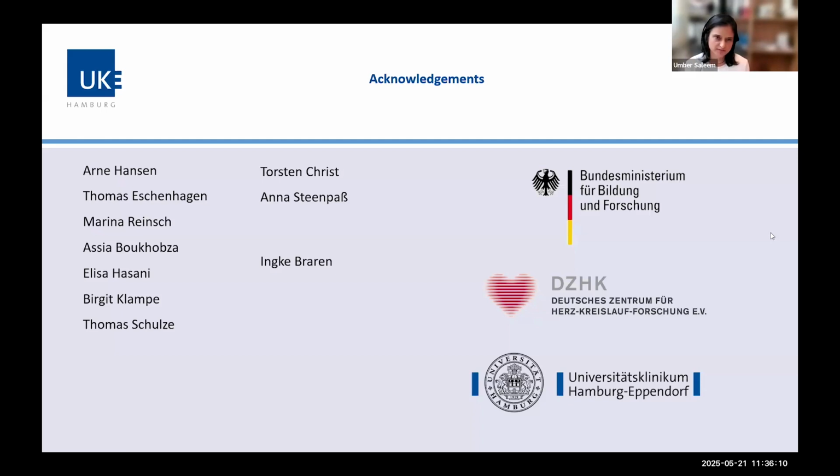Okay. So at the end, in your opinion, it's important to have all the three functional readouts. Yeah, so actually now we cannot use the calcium and voltage together, but for the moment we can only use force either with calcium or with voltage. Because this calcium sensor we have established and the voltage sensor both use GFP. They both use the GFP setting. So we still need to find a calcium sensor or voltage sensor with different excitation settings.